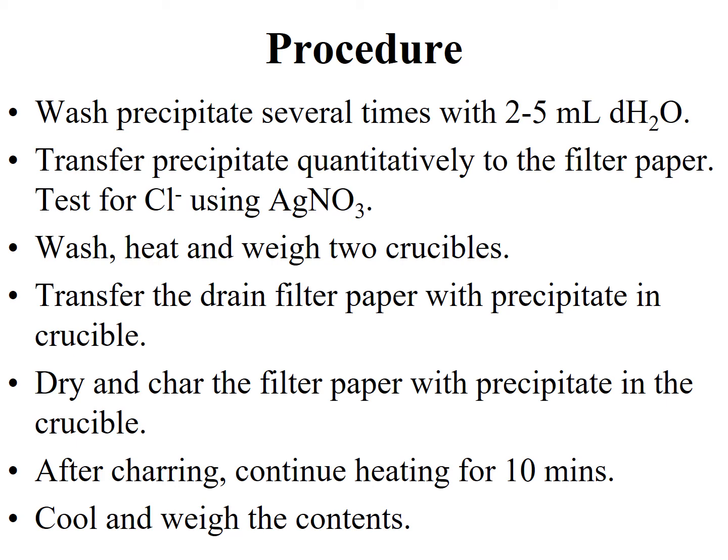Maybe before you did this filtration, you can wash, heat, and weigh 2 crucibles. Now once you drain the filter paper that now contains the precipitate, you transfer it into the crucible.